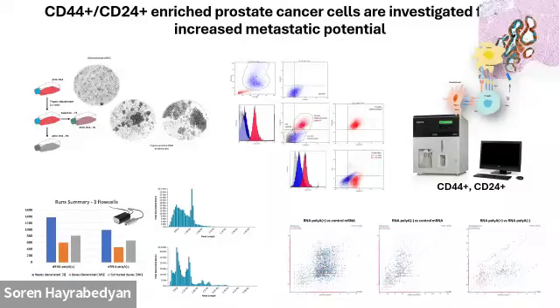All of our platform is based on long-read nanopore sequencing due to some of the advantages it has, but it was also very noisy before, and only this year there is a model that has accuracy of Q30 now, but so far it was very challenging.